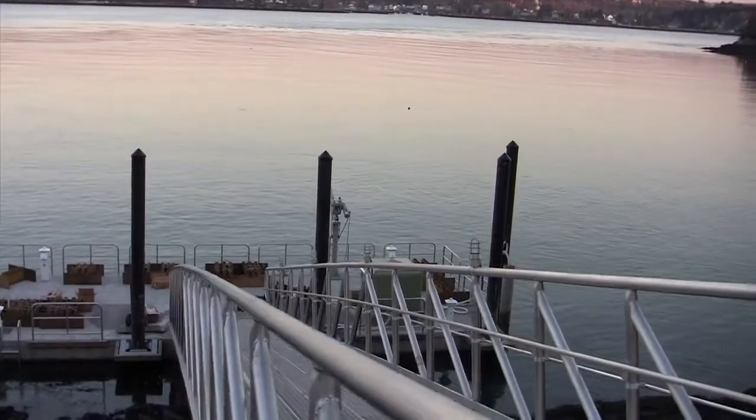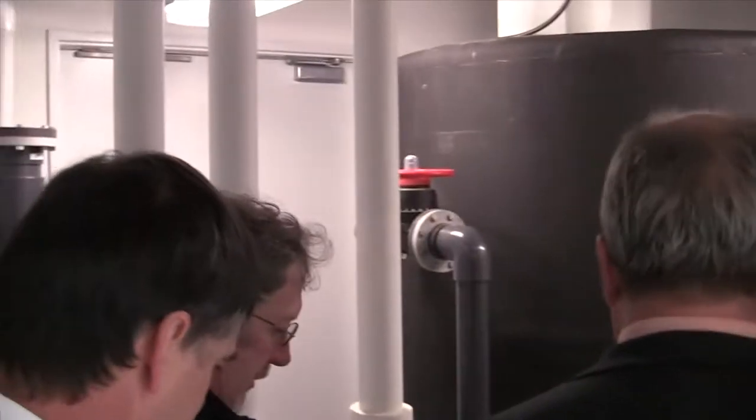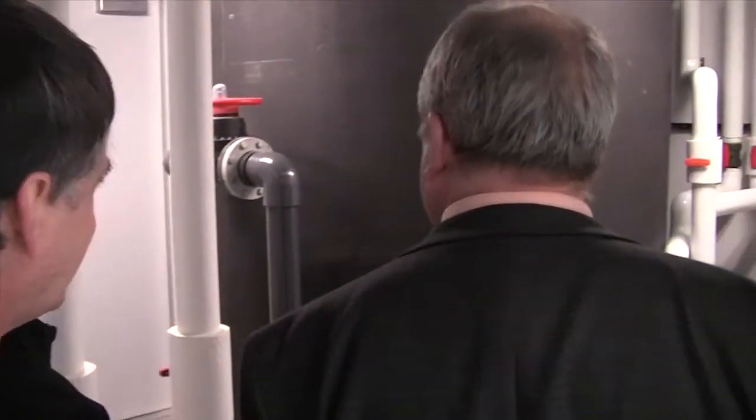We have a seawater pumping station. I'll show you some of that downstairs. It brings seawater up to the Center for Ocean Health for the experiments they're doing there in what are called mesocosms, which are large aquaria, and they can create conditions in those aquaria to see what happens. An oil spill, for example: what happens if you add oil to certain kinds of seawater ecosystems? So we have a whole lot of individual labs working together here.